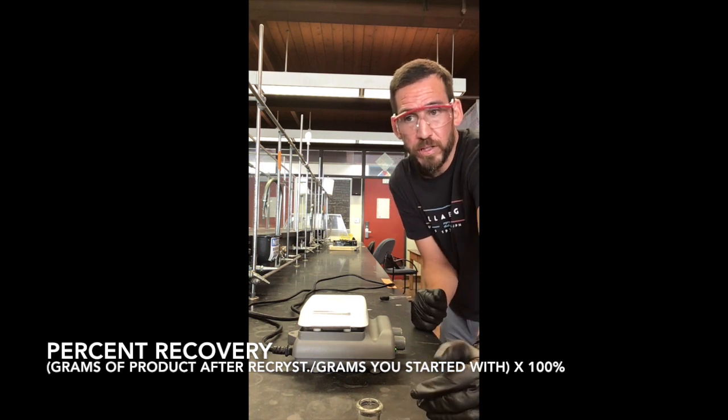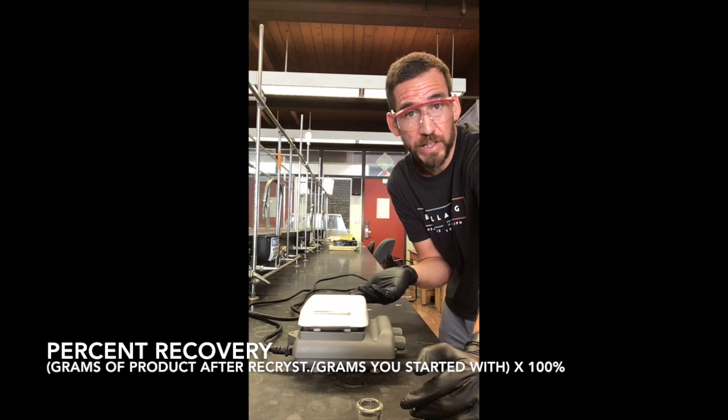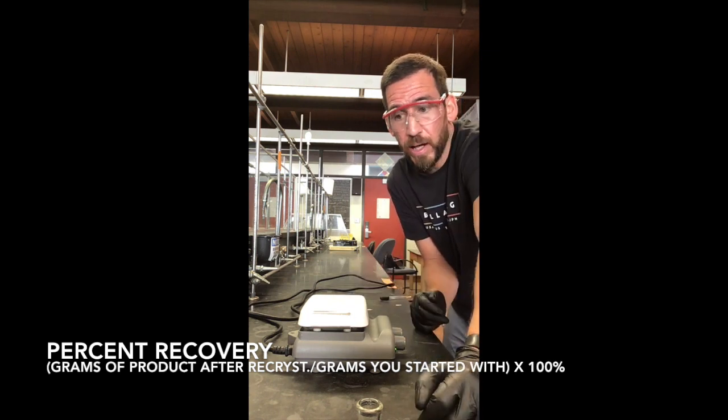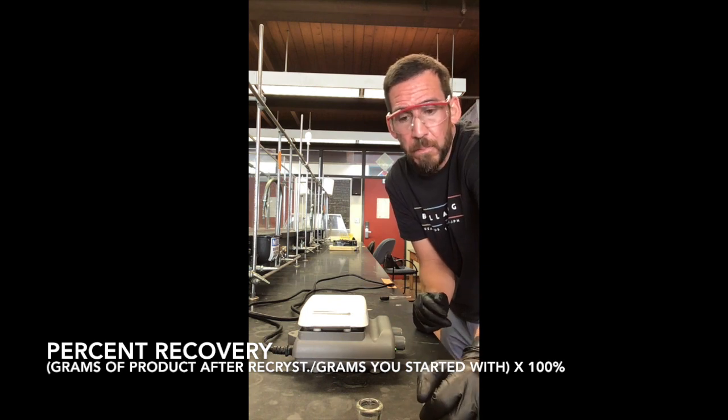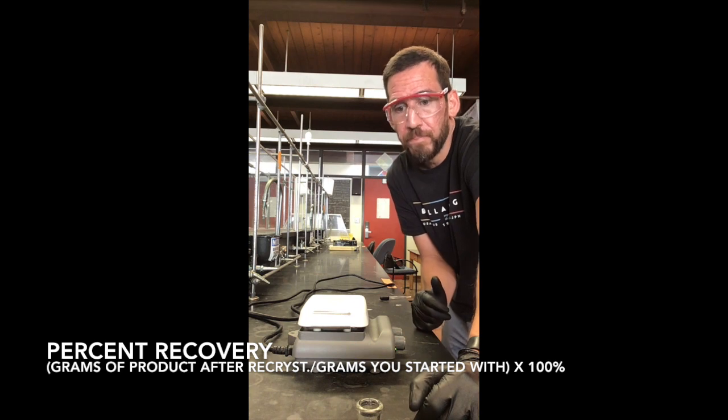And then what we wanted to do in the end is determine how much we have after recrystallization has occurred to see if there's any loss of product, which oftentimes there is. And so we want to see how much, right? So we're going to calculate the percent recovery.